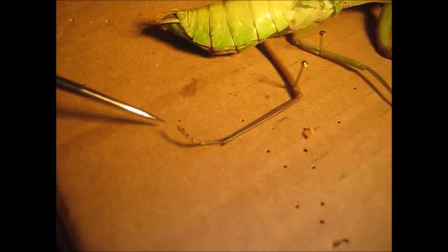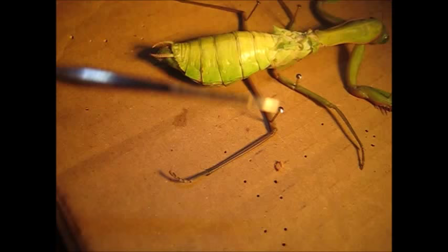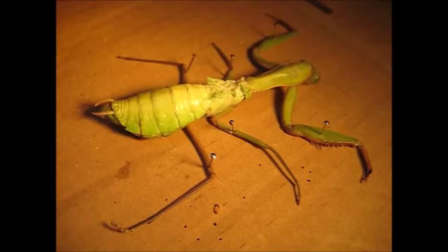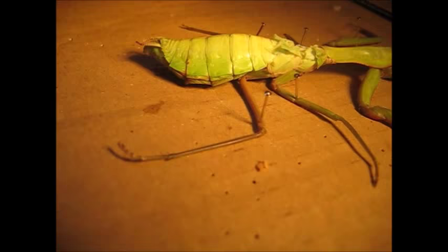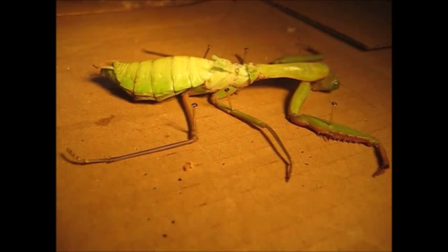Looking down here at the tarsus — basically the foot — it has several sections. This is the most complete one on this mantis. If you look over here, it's basically equivalent to having lost everything below the ankle. The tarsus sections are the bits that help them climb. In her last week she lost the complete tarsus of five of the six legs, so she couldn't climb, she couldn't hang from the ceiling — which is normal behaviour for a captive mantis. She was only able to cling on with that one remaining tarsus, so she was scrabbling at the glass of her vivarium, which is sad. That's why we decided to put her in the freezer.